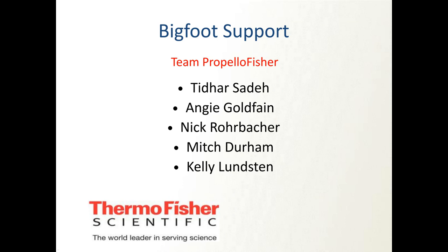Let's get started. Our first question here is, have you noticed any differences in the spectral unmixing method between the Bigfoot and the Aurora, since you have both? Okay, well, that's right to the point. The answer is yes.